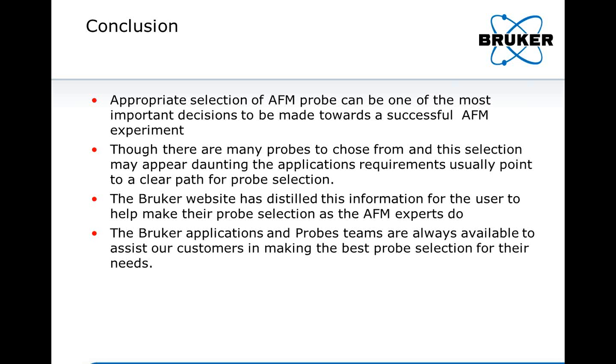So if you're using one of the shorter cantilevers, you must cut the other cantilevers off. If you have a sample where you think that the shorter cantilever will hit, it too must come off. To do this, generally just brush it with a pair of tweezers. They tend to come right off. I've also used a little vacuum tweezer. It sucks it right off.